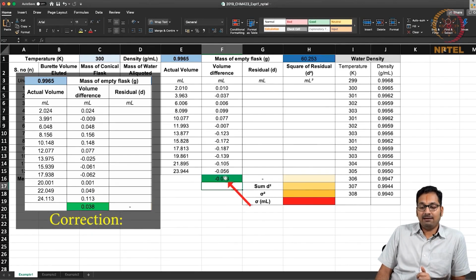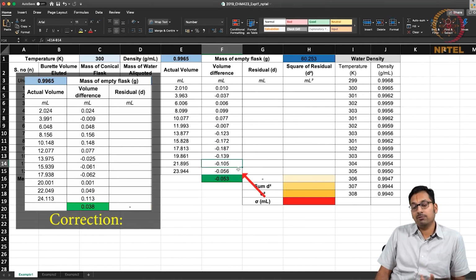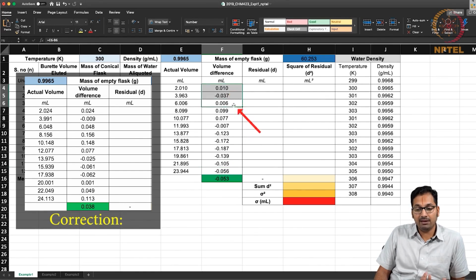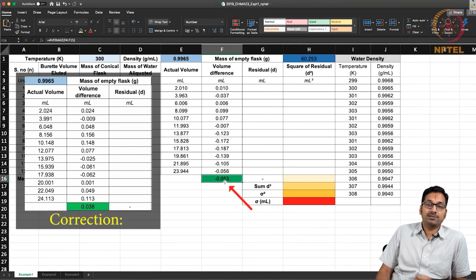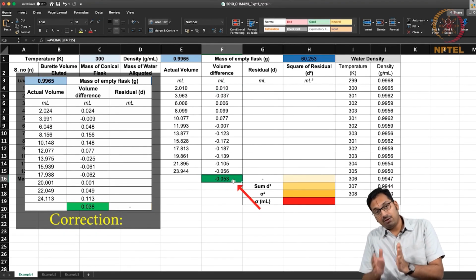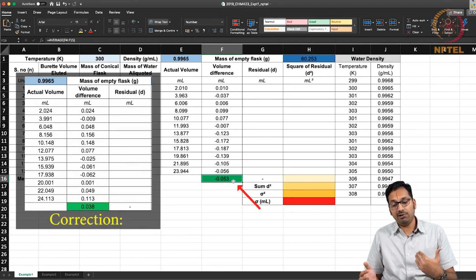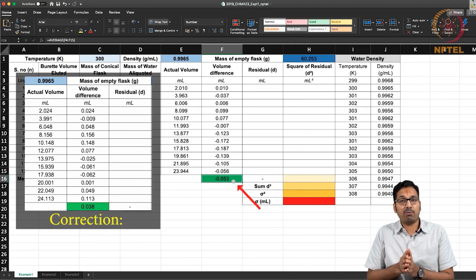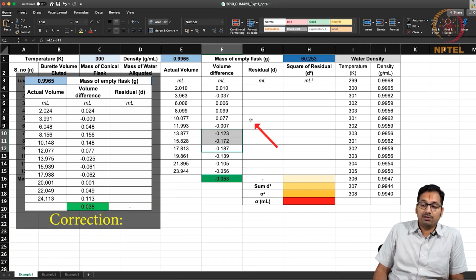You realize the average nicely represents values across, meaning that you have some values that deviate by minus 0.19 ml, while others deviate by minus 0.10. So, the average of all of this, including values that go away and in some cases positive deviations, finally comes to an average of minus 0.05. So, this once again indicates that you are probably erroneous in the second decimal, but thinking about the 3 standard deviations, you are probably looking at minus 0.15 also existing in a value, which nicely does happen in this data that you are looking at.